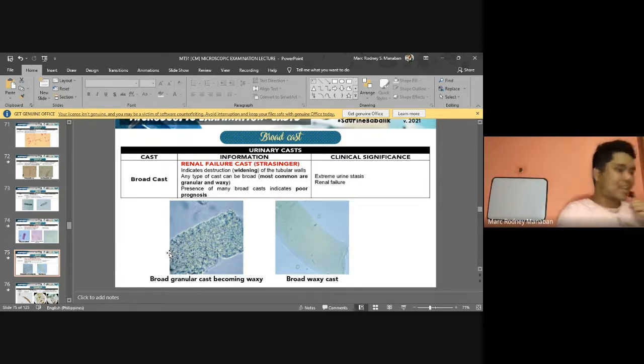Okay. So clinical significance, extreme urine stasis and renal failure. So again, according to Strasinger, this is the renal failure cast. Okay, so sir, what now? OMG! What now? What if the question in the boards or in the exam is, which of the following is considered to be the renal failure cast?